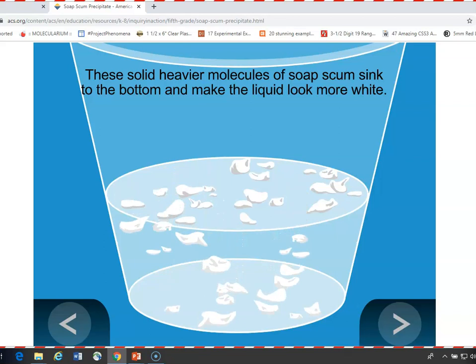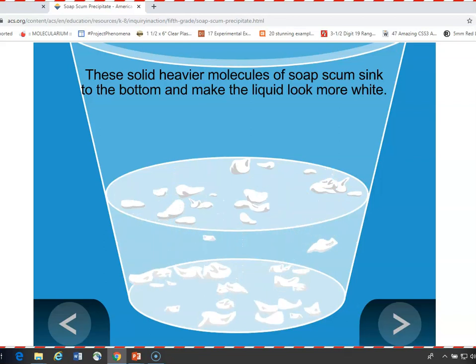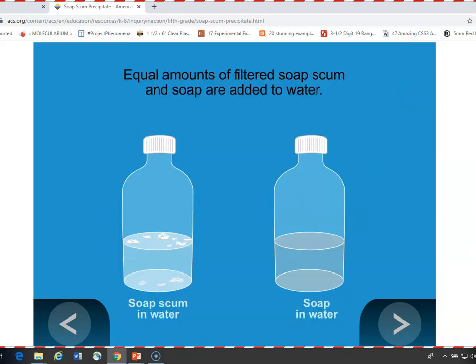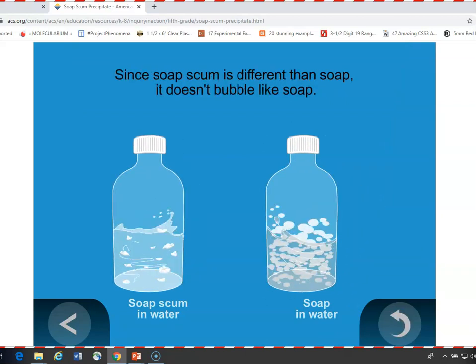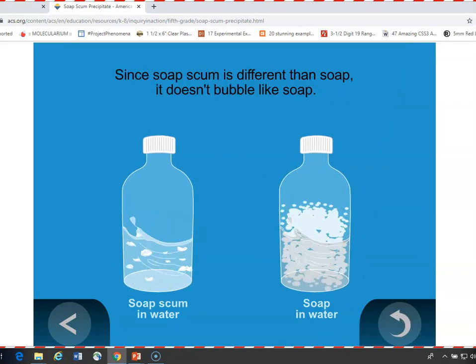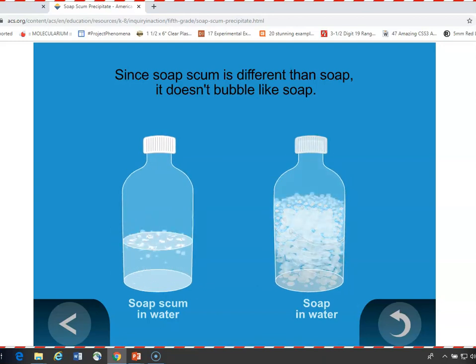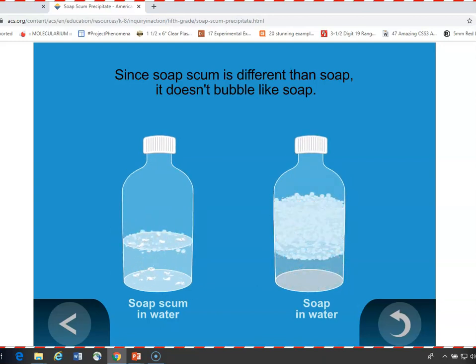Here you can see the particles of the precipitate. The last part of the activity shows what happens when you mix soap scum in water versus soap in water — the soap and water is much, much more sudsy. They're actually different substances at this point.